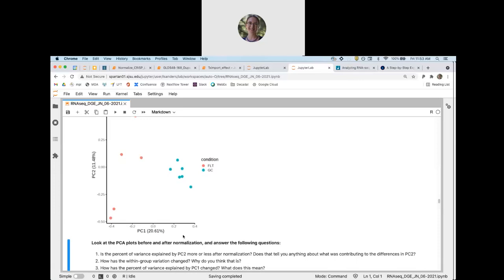How is the percent of variance explained by PC1 changed? Yeah, exactly. It's gotten bigger.